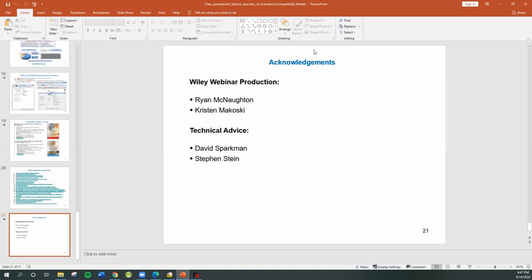When you do identifications, the library, especially in identity mode, makes it so easy. You push a button, you get results. But you've got to be careful. Certain compounds have very close mass spectra, but they might have different molecular formulas. And so you have to be careful it makes sense with the sample history, with your customer. So you need to think about it before you just report it out.